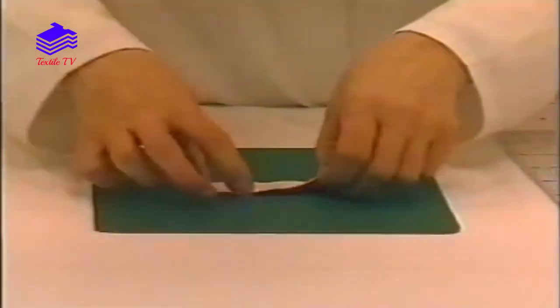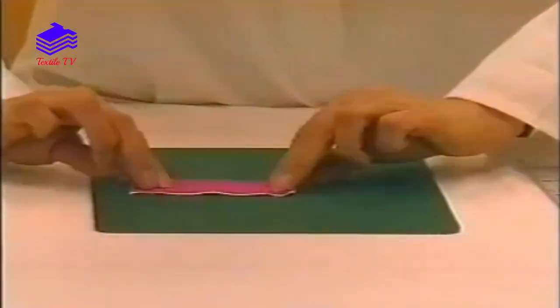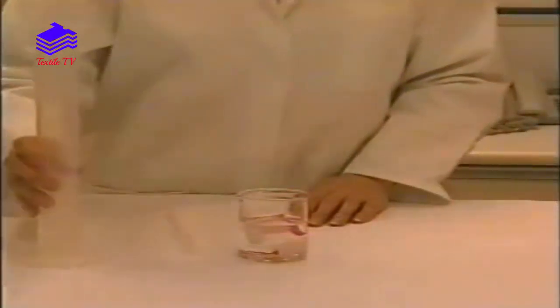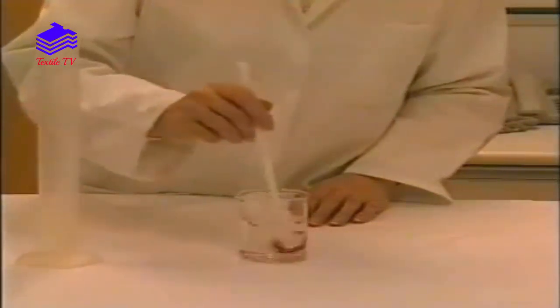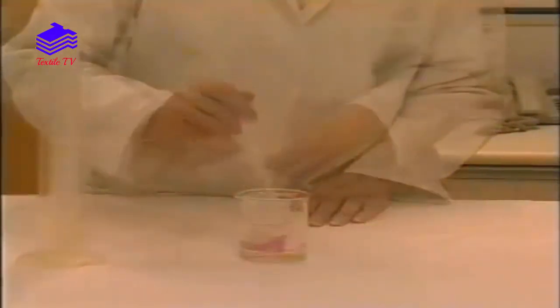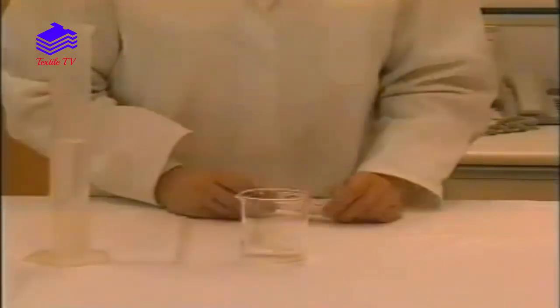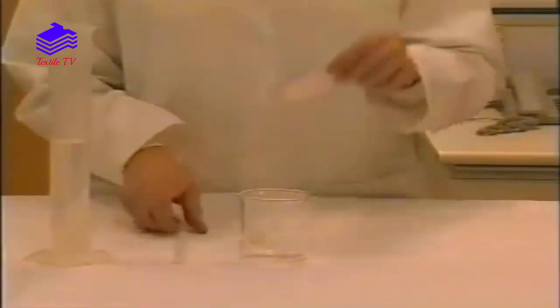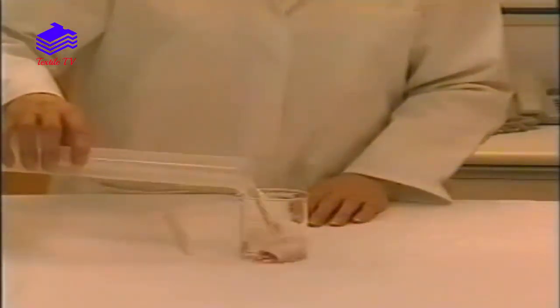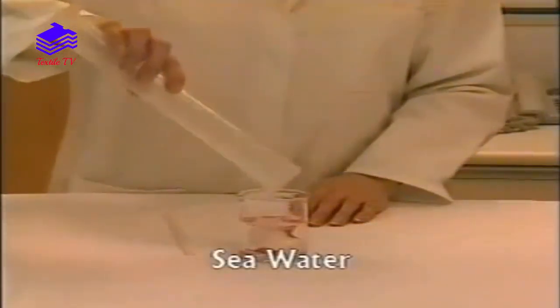The colour fastness to contact staining is determined by placing a specimen in contact with the prescribed multifibre strip, with the specimen and multifibre strip being wet out in water or other specified solution. There are several solutions used, the most common ones being perspiration and sea water.